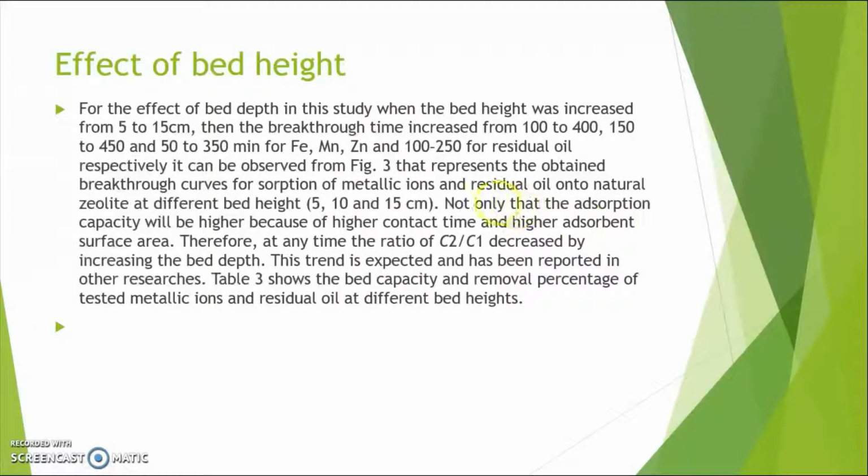Not only that, the adsorption capacity will be higher because of higher contact time and higher adsorbent surface area. Therefore, at any time, the ratio C2 over C1 decreases by increasing the bed depth. This trend is expected and has been reported in other research.